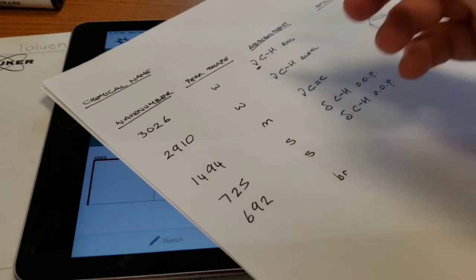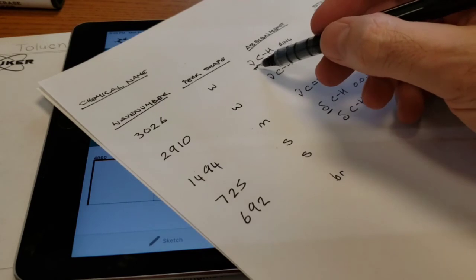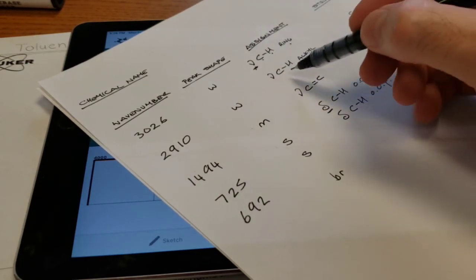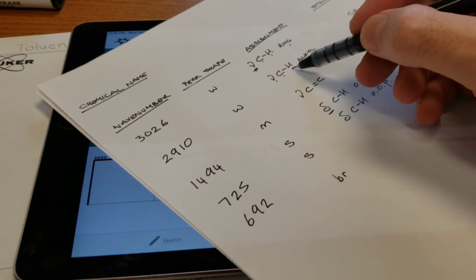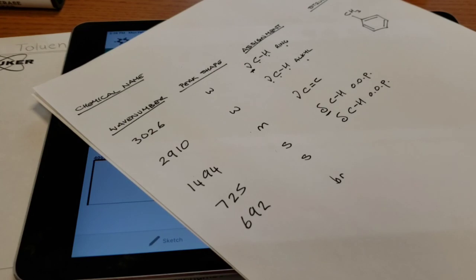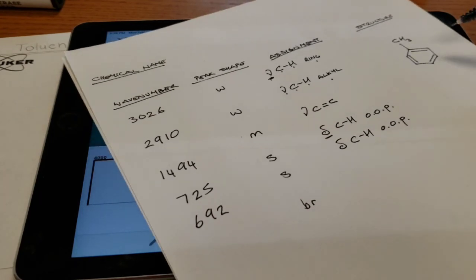A nu is a stretch, a delta is a bend. So this is a stretch from a carbon to a hydrogen that is attached to the ring, and a stretch from a carbon to hydrogen that is part of an alkyl substituent. And go through and make assignments of all the individual functional groups that you can, and then draw a structure of the molecule. Submit your finished product to the Blackboard submission link.